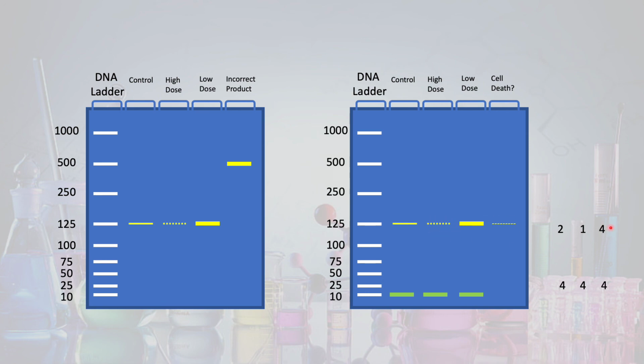And then in our low dose treated group, we have a really, really intense band for our gene of interest. So let's say now that this ratio is 4:4, so it's technically a ratio of 1, right? So the comparison between our gene of interest and our housekeeping gene allows us to more accurately compare the total mRNA transcription going on in our gene of interest.